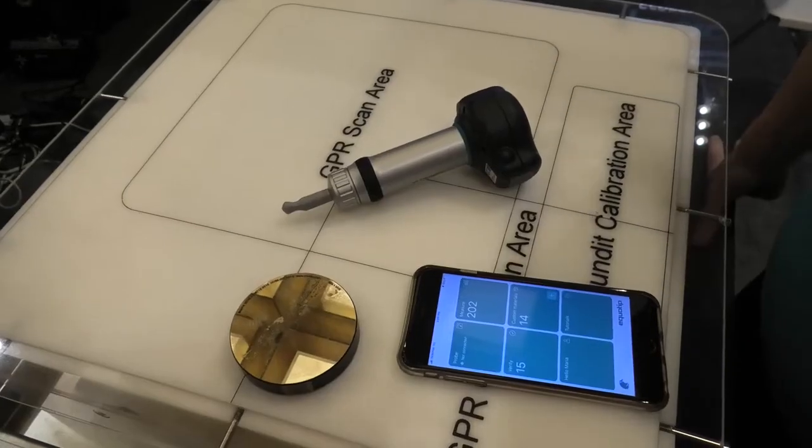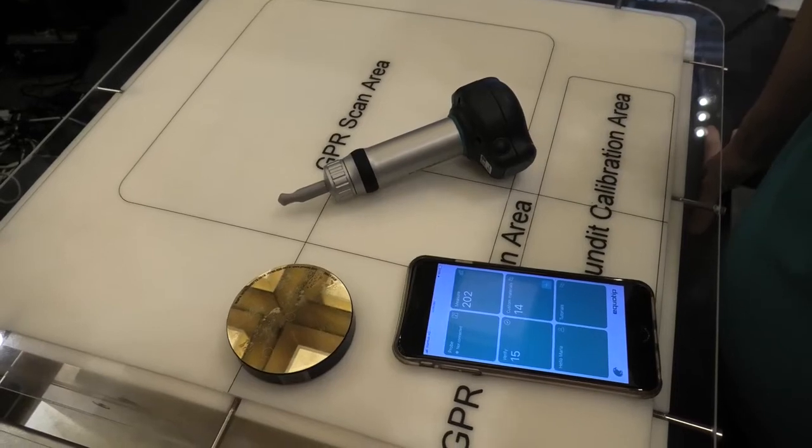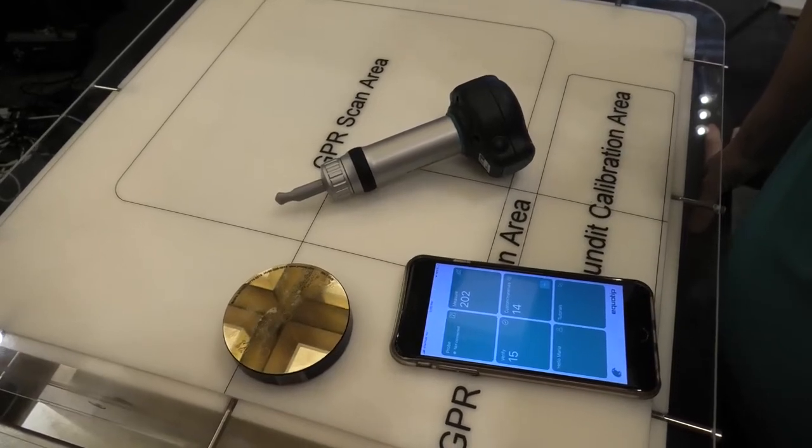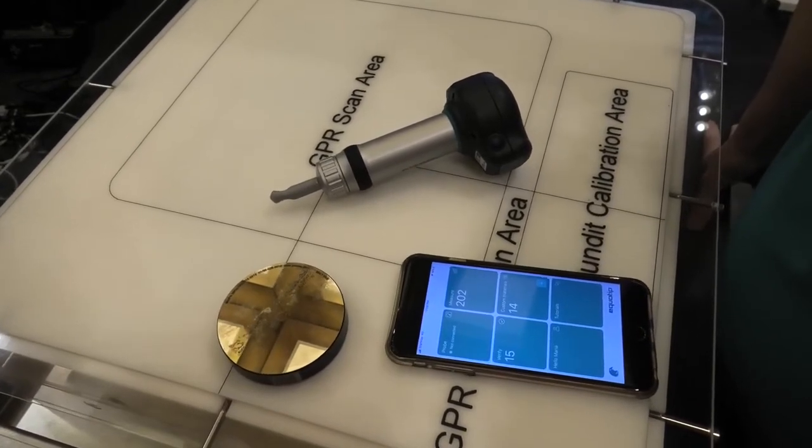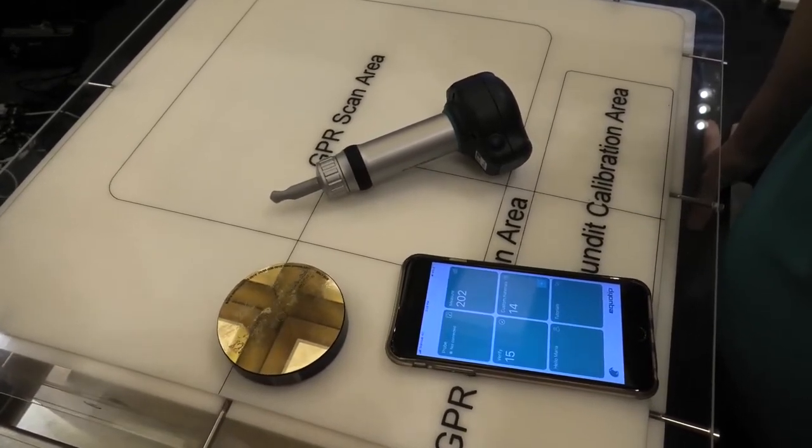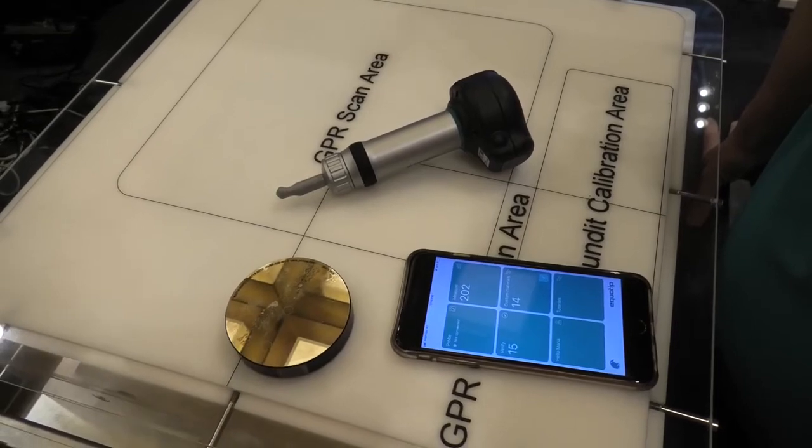This is ProSEC's Equitip Live UCI. UCI is ultrasonic contact impedance and it's a portable hardness measurement technique.